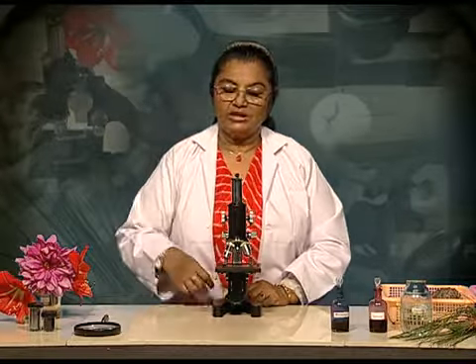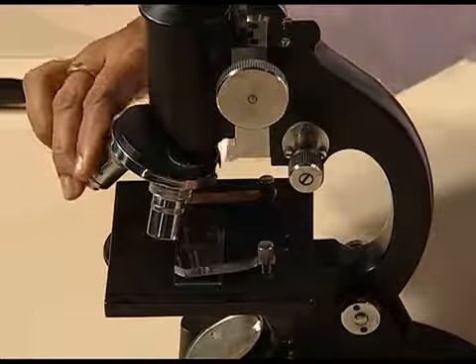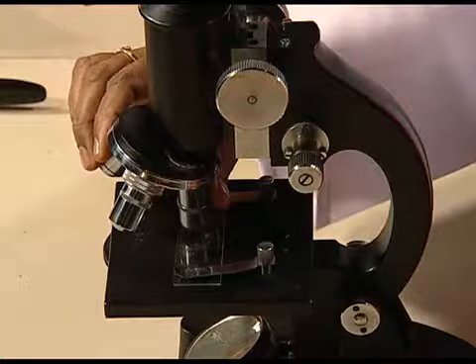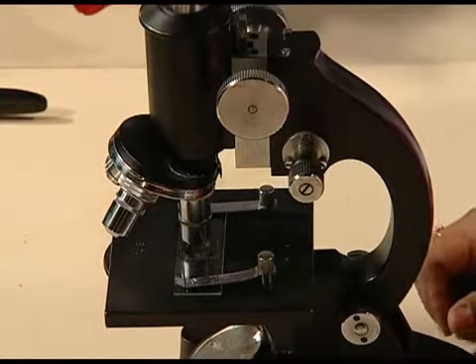If you want a further magnification of the image, you can go to the higher powered lens. Again, bring it slowly and wait to hear the click sound.